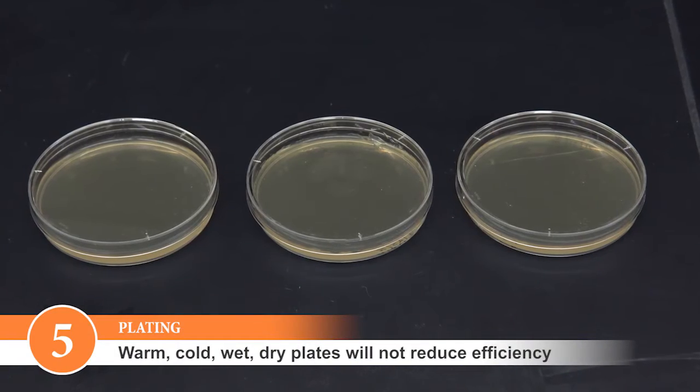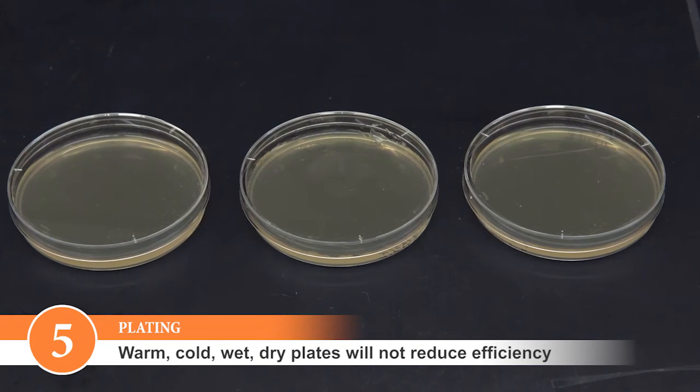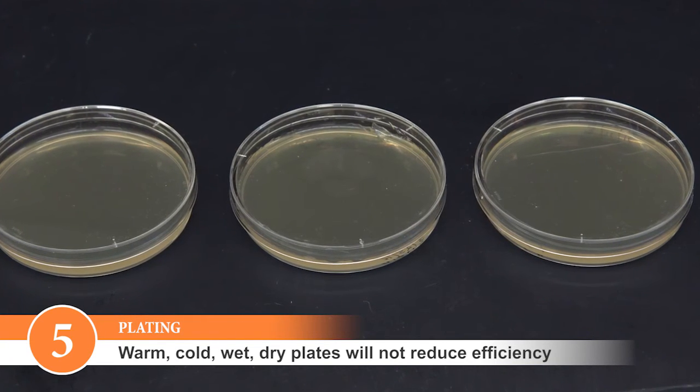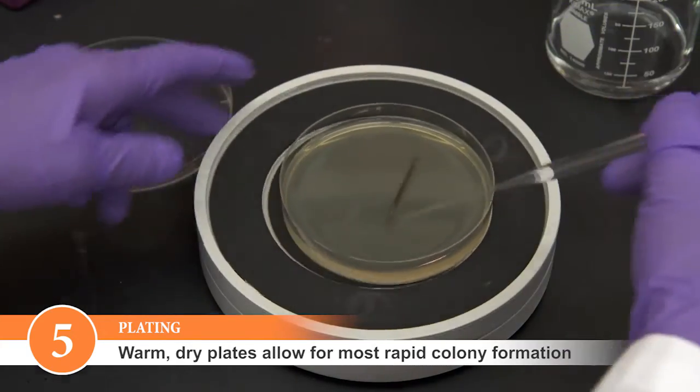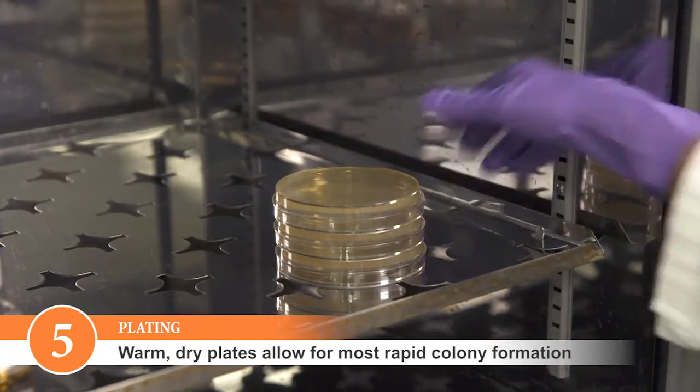Selection plates can be used warm or cold, wet or dry, with no significant effects on transformation efficiency. However, warm dry plates are easier to spread and allow for the most rapid colony formation.